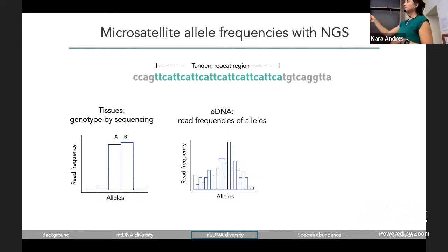So what I'm showing in the left histogram is what we might get from the sequencer for a single individual. So this individual, there's 5 total alleles, but there's 2 major alleles. And we know we have a diploid species, so we would call this a heterozygous AB at that locus. But there are some low frequency alleles hanging out there.